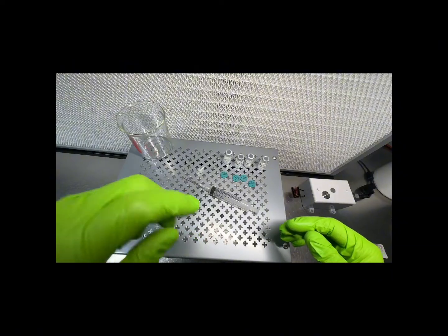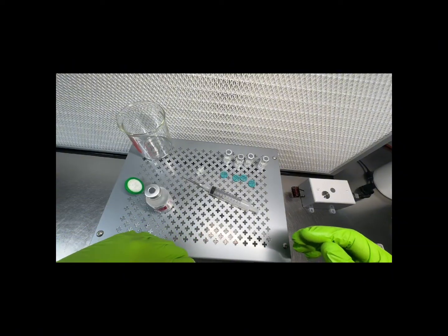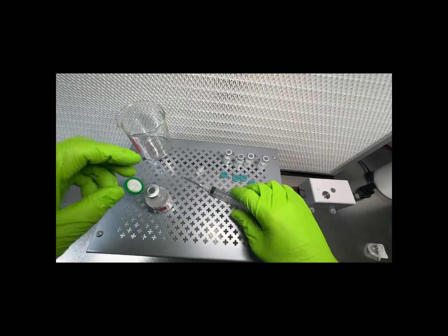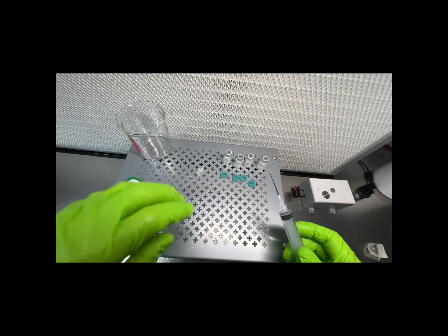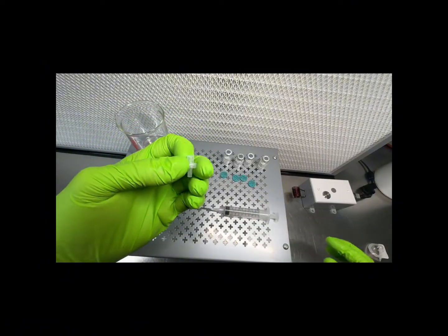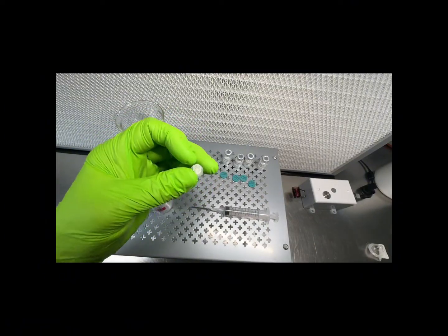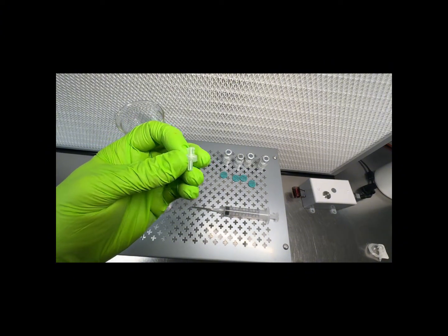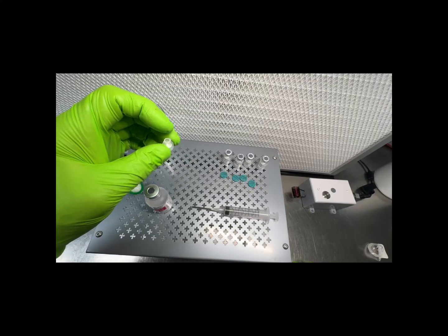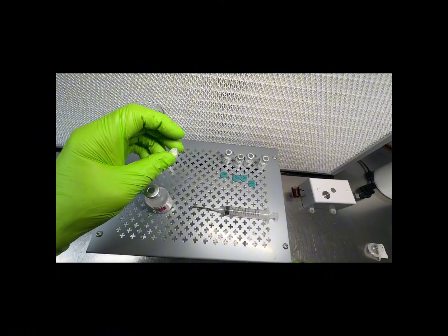In that case, it would be a drain, but in this case, it's the filter. So all syringe filters are going to be subject to clogging at some point. This 4 millimeter PES 0.22 micron filter is rated on average for about 1 milliliter or less of filtration, but that is across a wide variety of solutions that you might run through it.